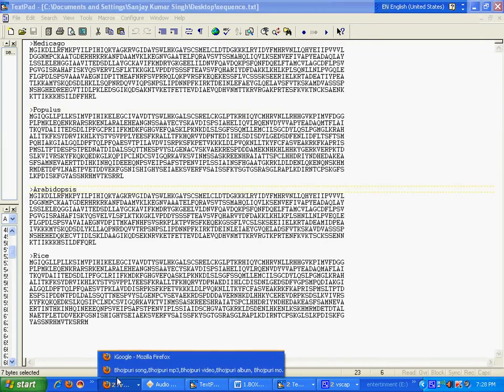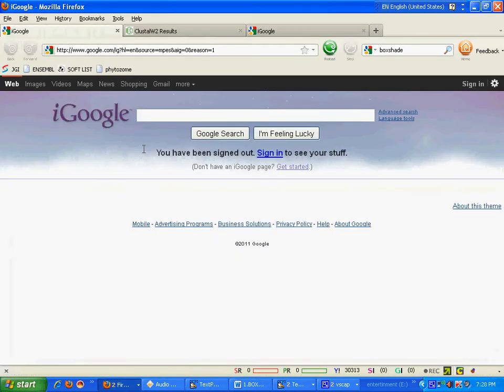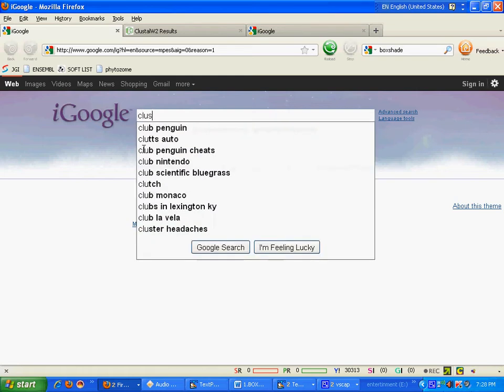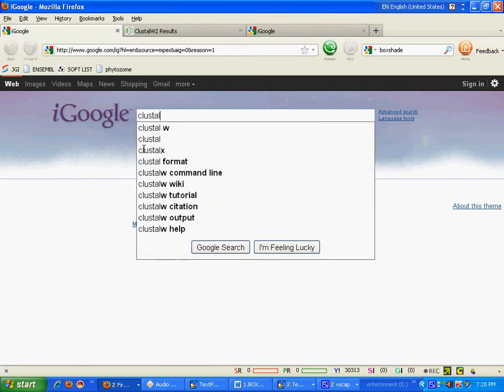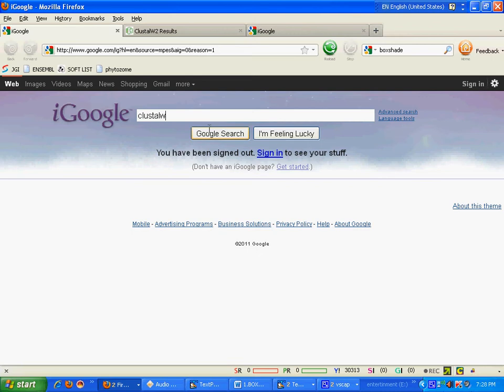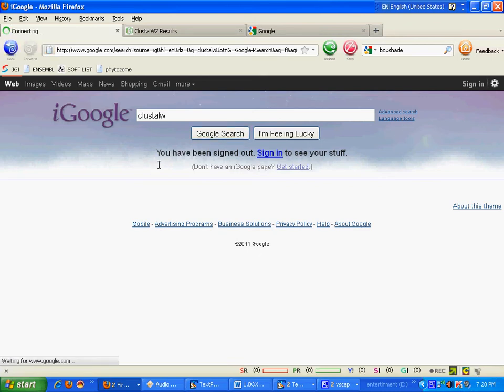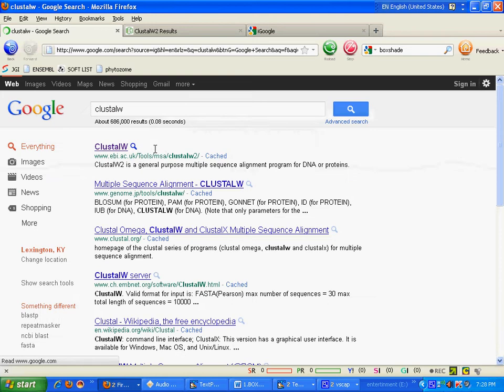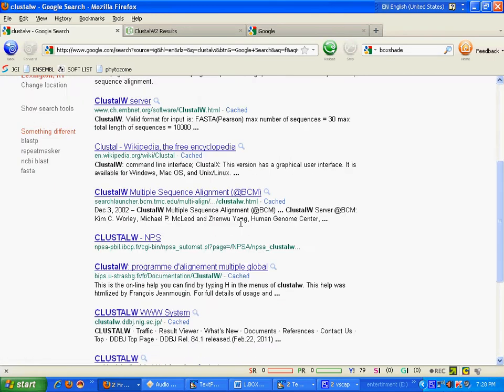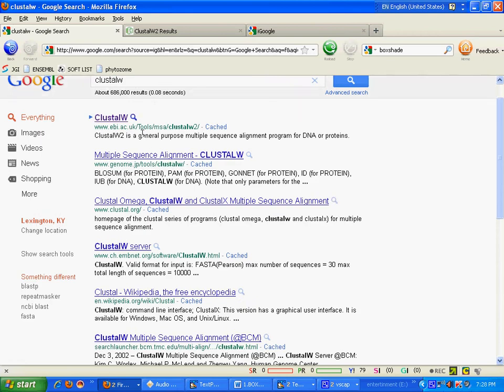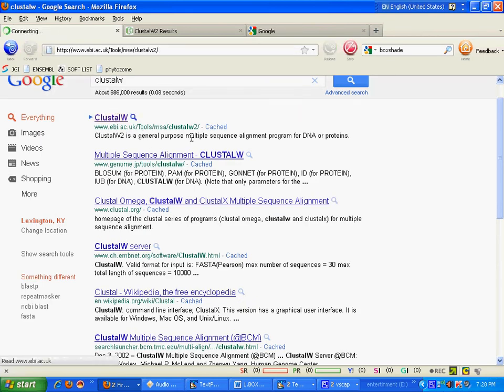Then go to Google search for ClustalW. Since this is a very popular server, it is hosted on many websites. But we will do multiple sequence alignment through EBI server.